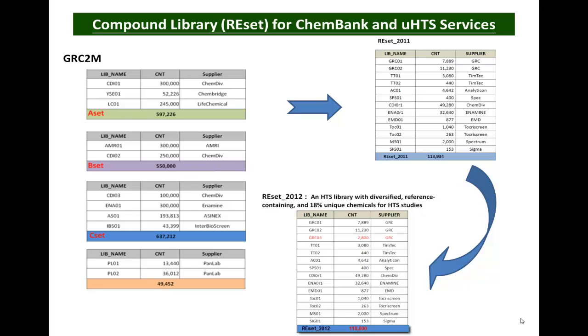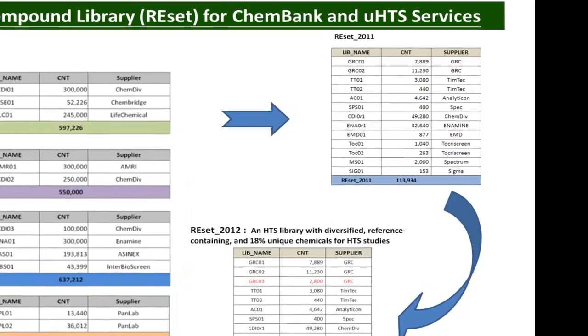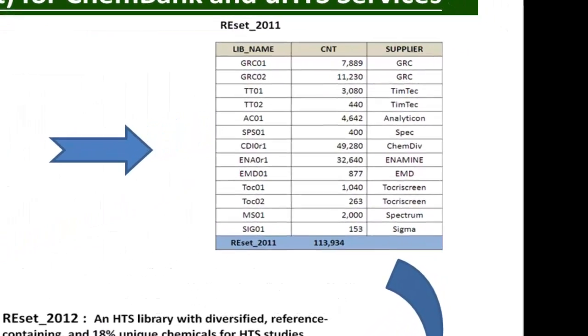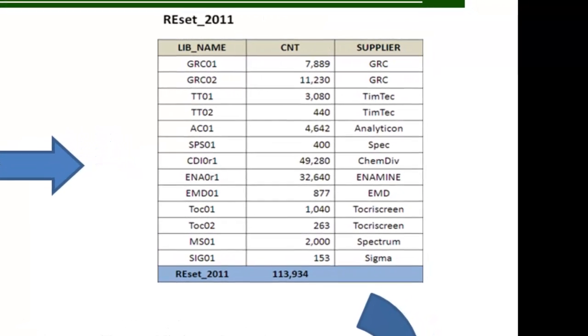Because of that, we select from each set of compounds. We divide the compounds into many categories, and from each category, we collect several compounds for the representative library. The representative library represents the entire library because all the skeletons in the entire library are present here. In addition, we also have all the known compounds or known drugs, the APIs, present in the representative set.